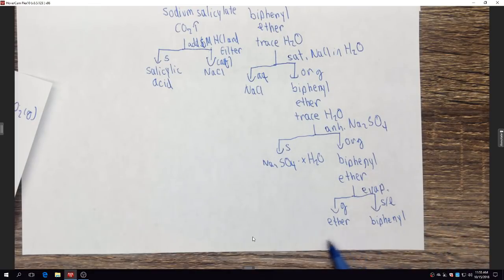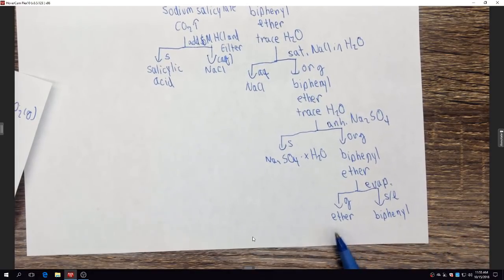How are you going to know when the ether has completely evaporated or boiled off and you just have liquid biphenyl in your flask? Physically, how will you know that? It'll stop boiling. So a boiling liquid, you see bubbles. It doesn't matter if it's ether or water or whatever. If you see the bubbles and the boiling, then you know that there's still ether there. If you see a liquid but it's not bubbling at all, then it's probably just liquid biphenyl. And it's very common to get liquid biphenyl, okay, because we have to crank up the baths because nobody wants to wait for the ether to evaporate, which is understandable.